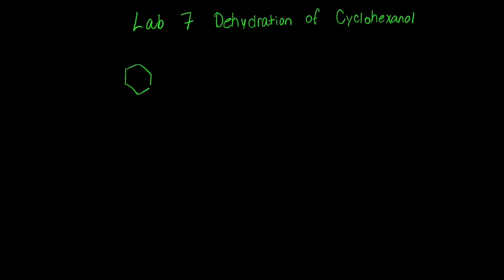The way we indicate heat is with a triangle. This is the Greek symbol for the element fire, but we still use it. And when you have a catalyst, oftentimes that's written below the reaction arrow.